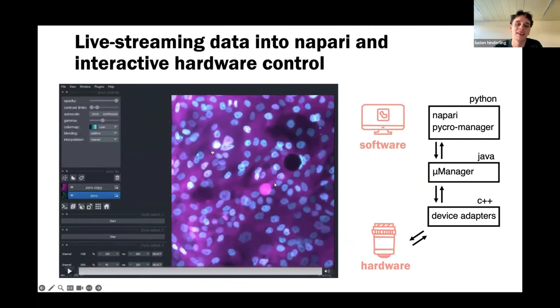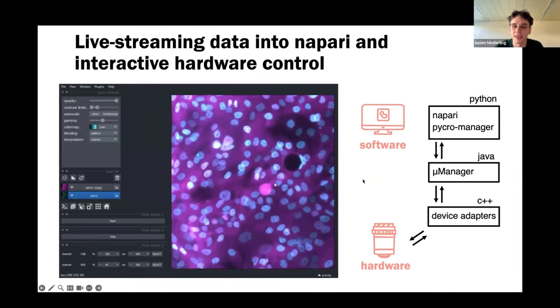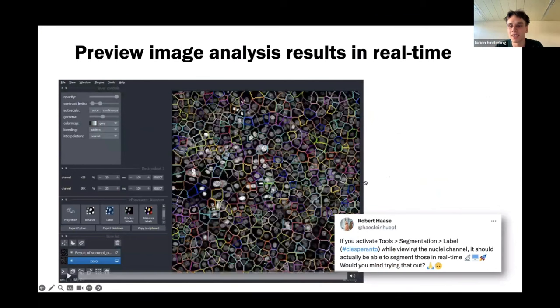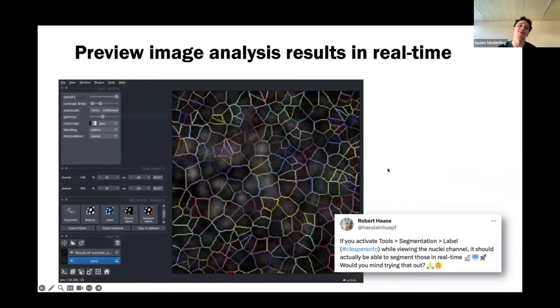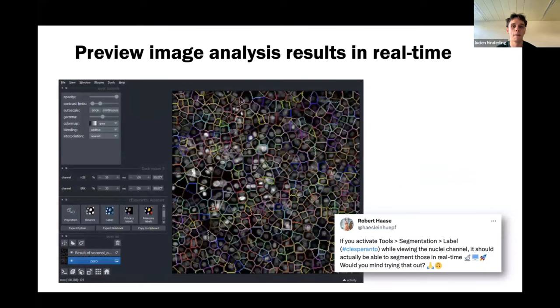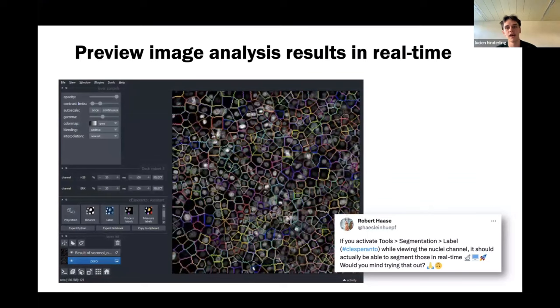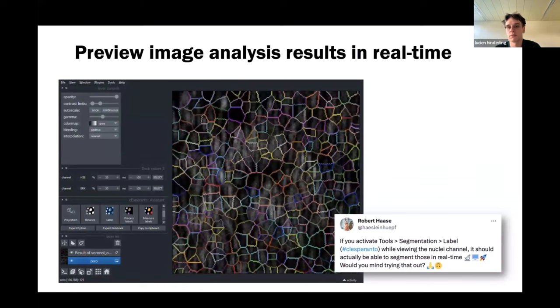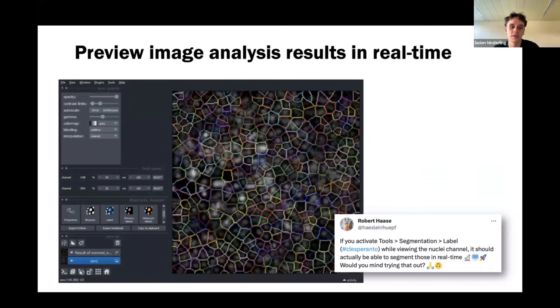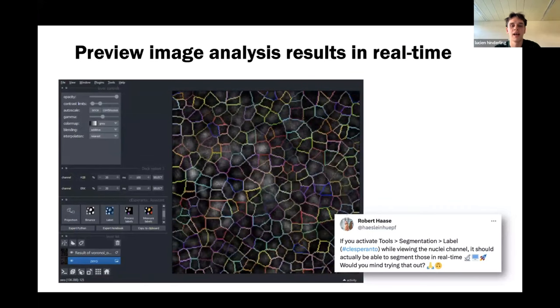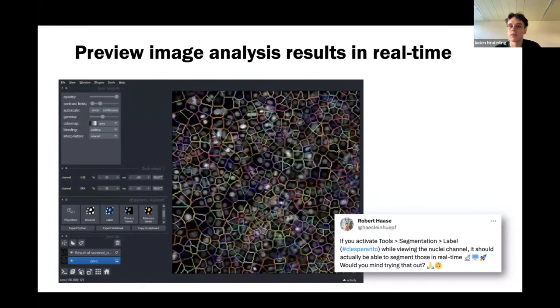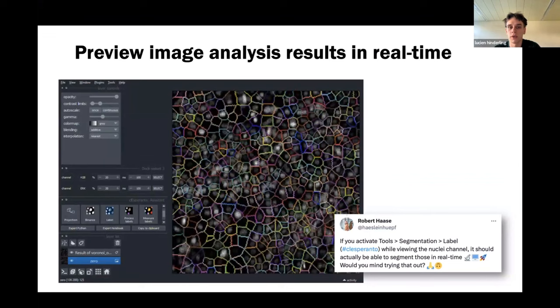Once I got the first streamed images, I posted on Twitter and got a comment asking if I could try a plugin on top of the live stream data to segment cells in real time. Of course it worked — it was a single click to add the plugin, select the classifier, and it directly worked on the live stream data. This is the magic of Napari: once you have data in there, you have the whole Python and Napari plugin ecosystem. It doesn't matter if you load data from disk or live-stream it from a microscope — you don't need much adaptation to make the code work.